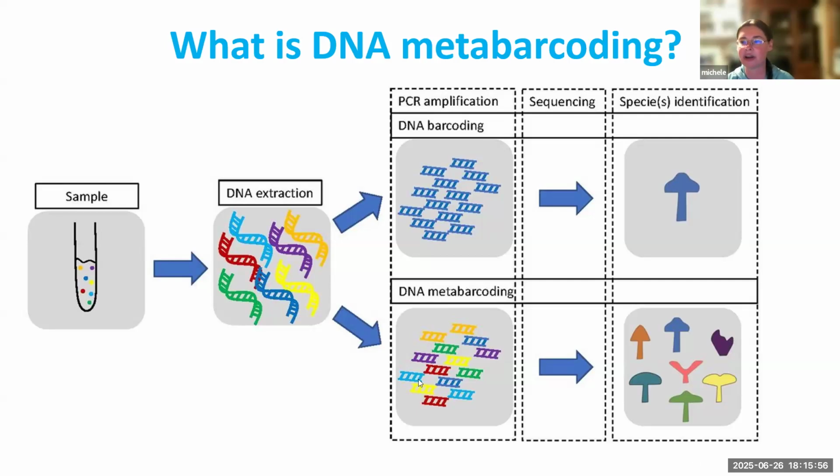And that's why metabarcoding is so powerful, because traditionally in a sample, you'd have to tease apart every individual thing, isolate it, and then identify it, and then reassemble that back together somehow, which is artificial and obviously going to be prone to a lot of error. I wish this existed 20 years ago. My PhD would not have dragged on nearly as long as it did. This would have come very much in handy.